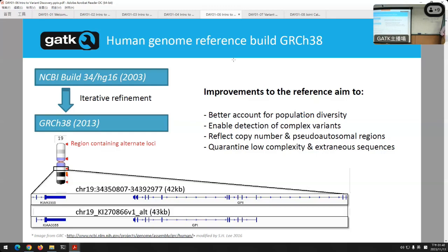Aaron, yours is against HG38 today. Do you know? Actually, no. Okay, so Aaron's going to use no reference. Oh well, thanks.